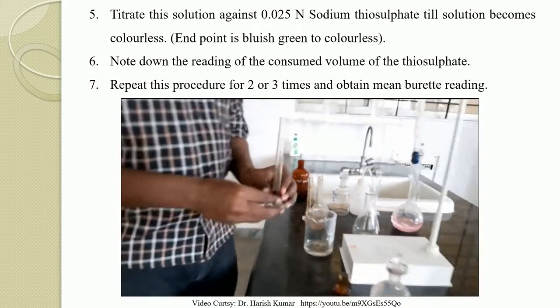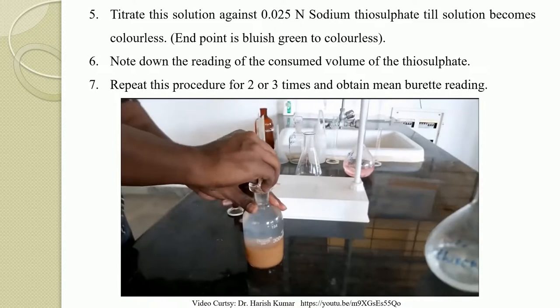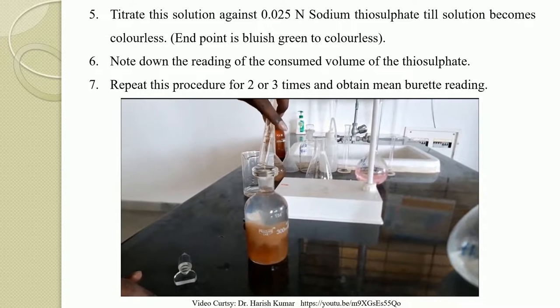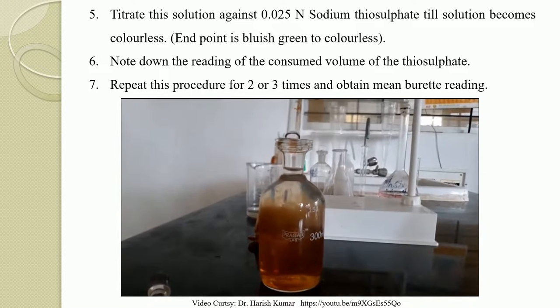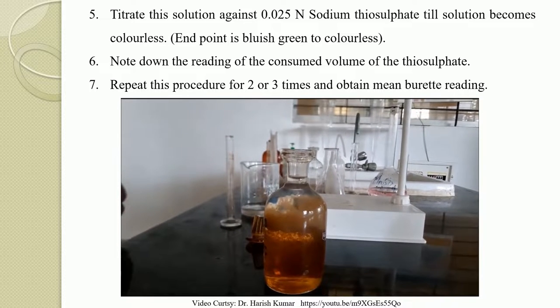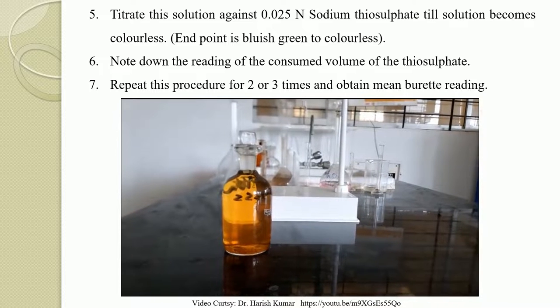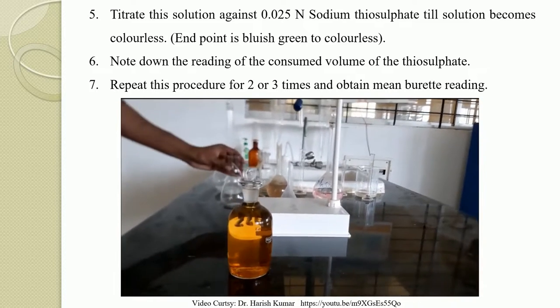So 2 ml of concentrated sulfuric acid is added to the sample after the precipitation. You can clearly see that it has turned into a dark straw color. Now exactly measure 203 ml of sample from the BOD bottle and take it to the conical flask.